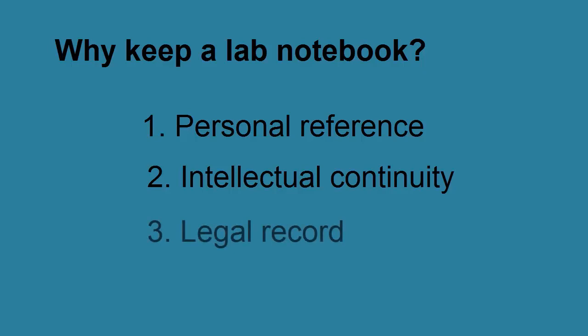But probably the most important reason why we keep a laboratory notebook is because it serves as a legal record of the work that you do in the laboratory. And this can be absolutely crucial when it comes to things like filing for patents, or if you're working in a toxicology laboratory and you need to be able to serve as a witness for a case. So a laboratory notebook can be very, very important. In fact, the failure to keep a proper laboratory notebook could result in your termination from a job.